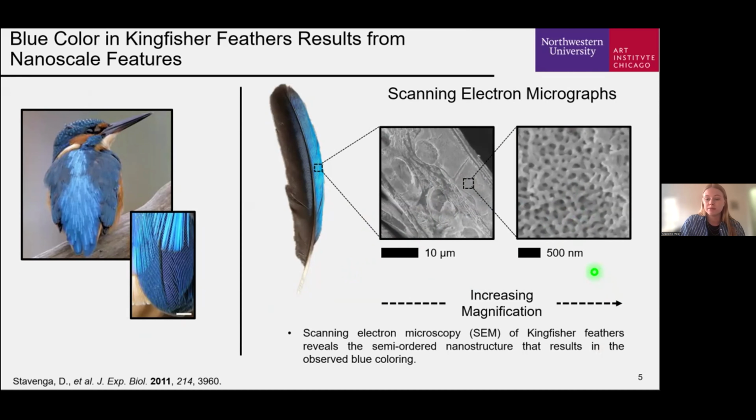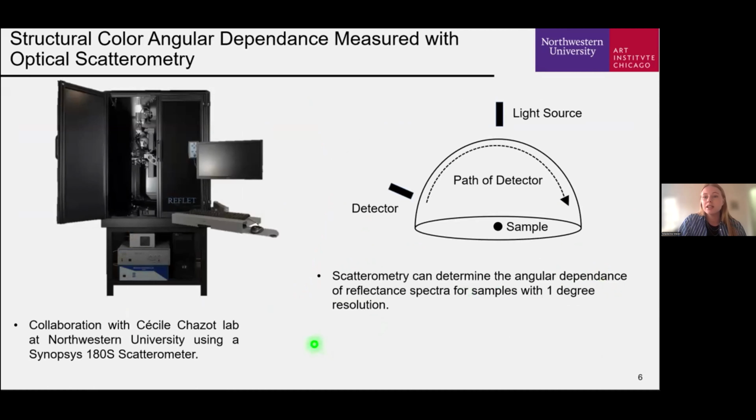The structure's features of the pores are on the order of hundreds of nanometers, and the spacing between adjacent pores is on the order of 200 nanometers. To better visualize the angular-based changes in coloring, we turn to optical scatterometry.